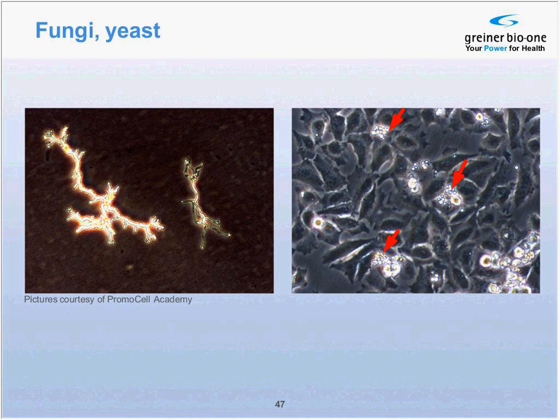To prevent the appearance of fungi, it's very important to keep the water bath in cell culture labs as clean as possible. This can be done by general regulations such as wearing gloves, keeping doors and windows closed, of course regularly changing the water, and also by the use of a water preservative.